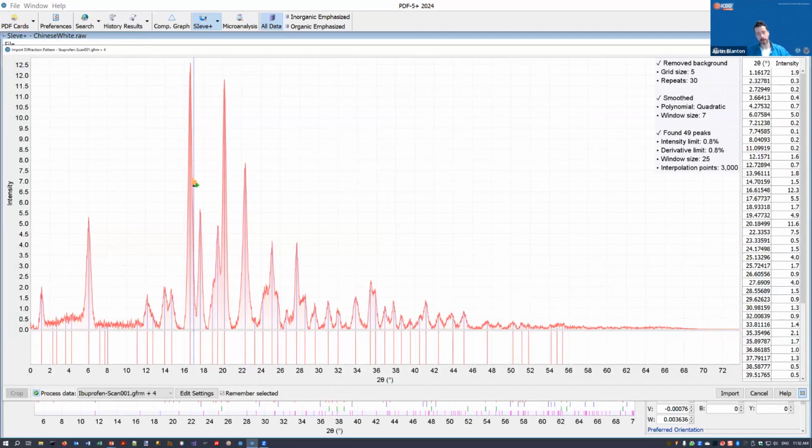So what has happened now is that we've stitched and merged all those 5 integrated patterns into a single 1D plot that you see here. So now we're kind of working with a more traditional 1D pattern. And the beauty of that is now we can employ all of our traditional techniques and algorithms that we've had for 1D patterns. We can now employ them to this pattern that was integrated from the 2D patterns.